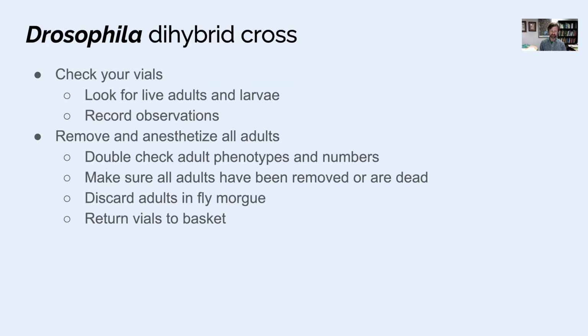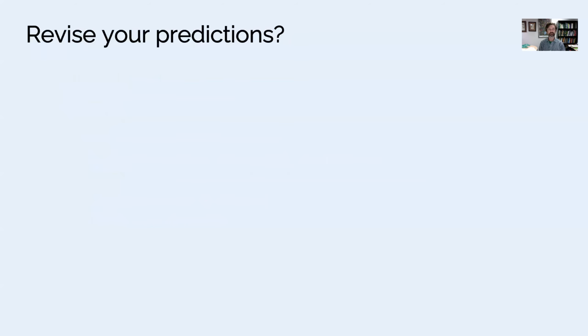Like I said, we can't really undo or redo anything during this semester, but taking notes about what you get, whether the larvae were present and the phenotypes of the adults, is all good information to have this week.